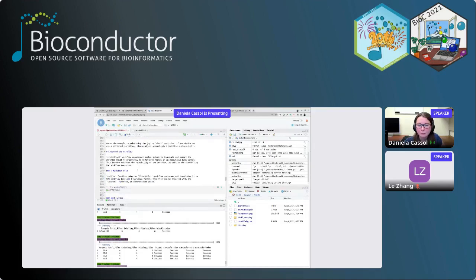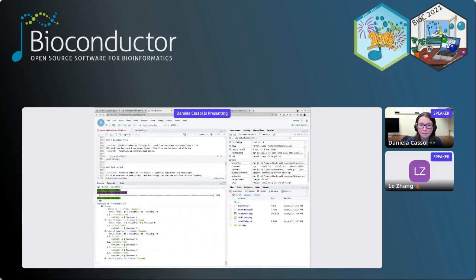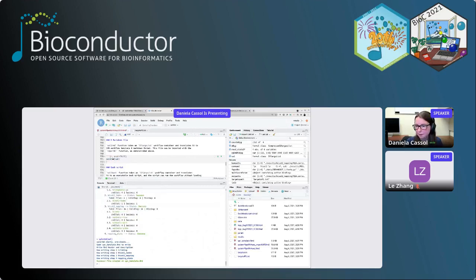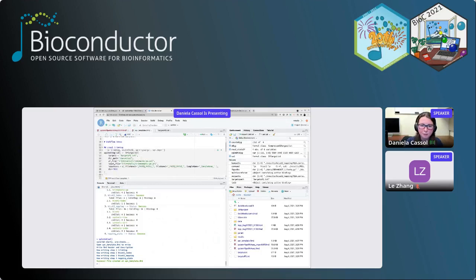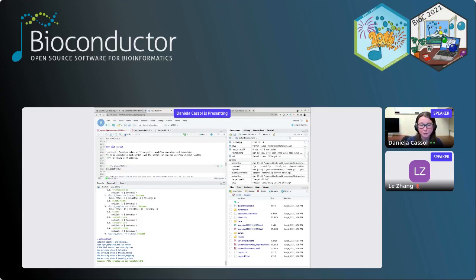Okay, the last thing I will talk about here is how to export. We have here an entire object, our workflow container, which has all those 4 steps, and I did this in interactive mode in our current session. One of the possibilities is to export this to R Markdown format. I have this function called sysargsList to R Markdown, and what this is doing is creating this SPR template in our current environment, which is basically everything we just created live here, saved in R Markdown format. Then you can go back to the beginning and use the import function again and generate the workflow really, really quickly.